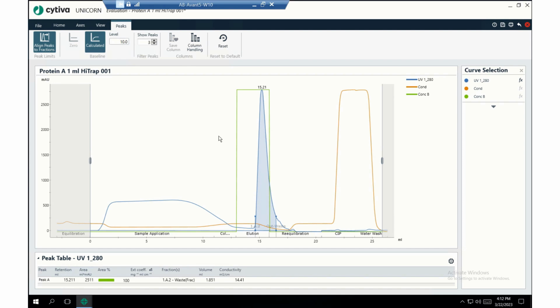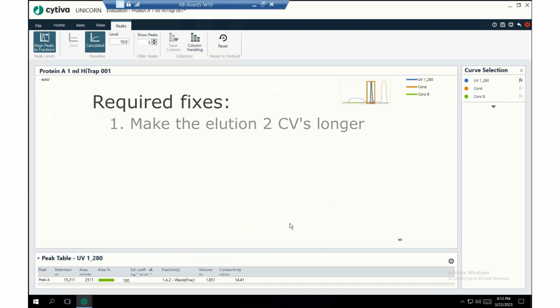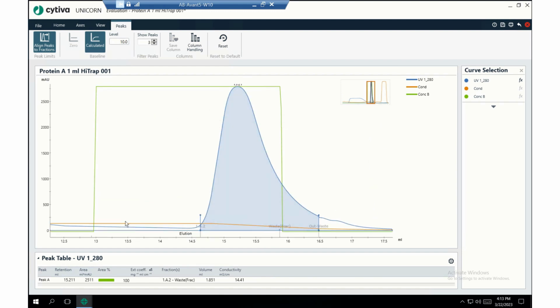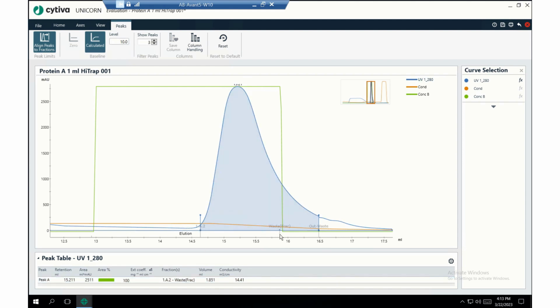First, in the method, fractionation is only allowed to occur inside the elution phase. Why is a topic maybe for another time. So we'll just have to make the elution phase longer, maybe 2 CVs longer, 5 in total. So what I'm talking about is right here. Even though this is highlighted in blue, the peak fractionation ended right here. You can see the out right there. So the peak ended right there, and you can see inside the peak table, we only collected 1.8 mils. So from here to here, right? There's the waste out. You can see it a little bit more clearly right there.